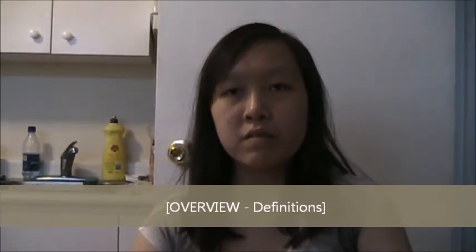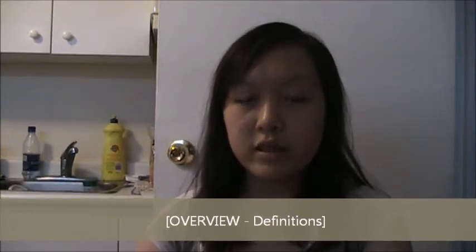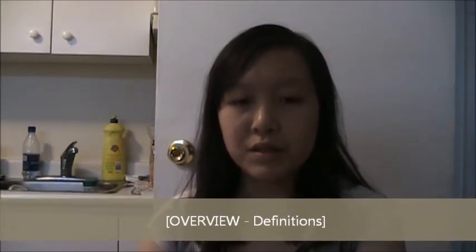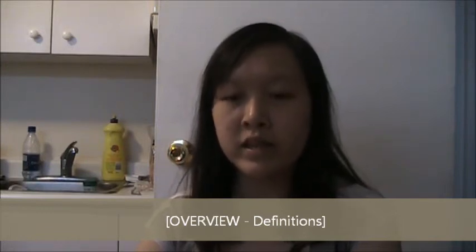Here's an overview of what we're going to cover. First of all, I have 6 definitions that I think you should know. First of all, spectroscopy/spectrometry is a study of the interaction of energy with matter.